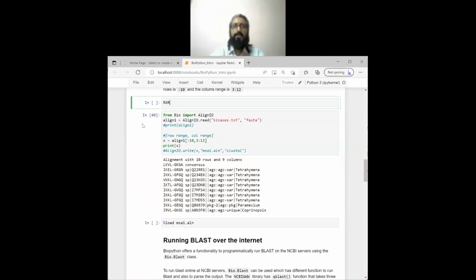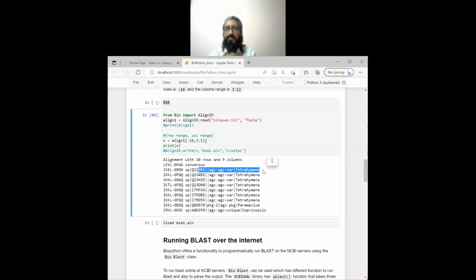The program can find it, but since you know the motif, one thing you can do is open your alignment in a text editor, and in at least one sequence, if you know the motif, just note down the position in that sequence.